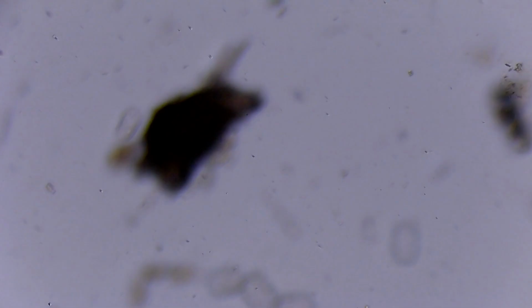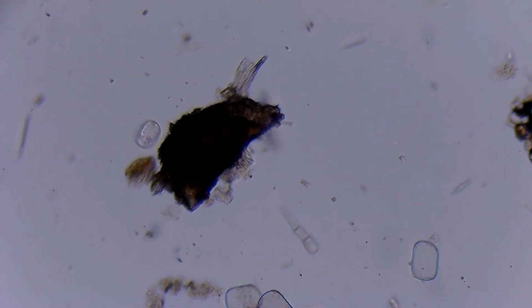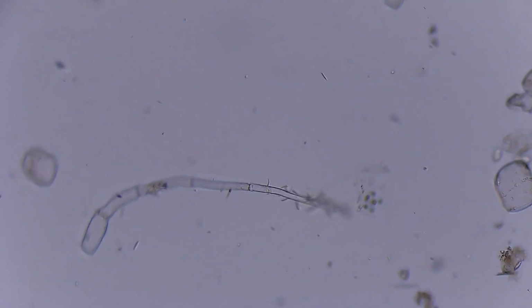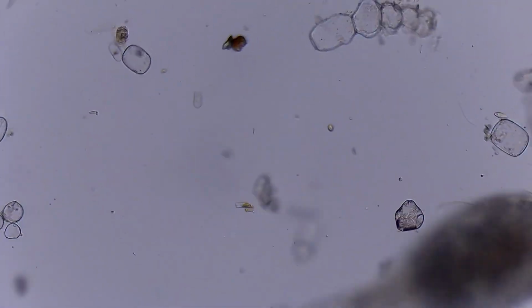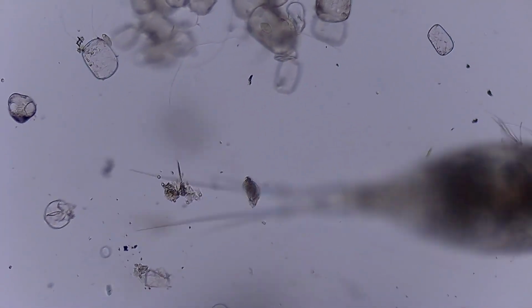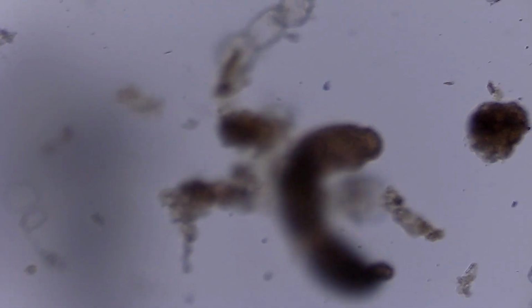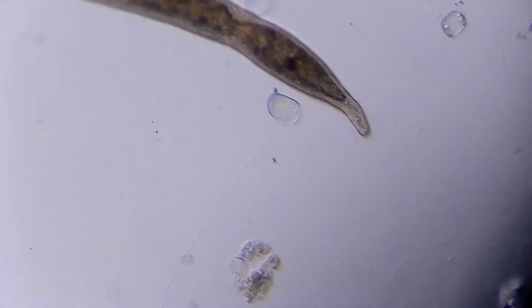Which is really interesting. Now we're switching so that we can see the top view and hopefully get a different look. No, I just zoomed in a little bit more. And let's see what these guys look like. It looks like that was a leg to a copepod or an antenna that fell off. But this is one of the guys. Let's see if we can get him in focus here. Oh, never mind. Look at this guy. So I don't know what this is, right?